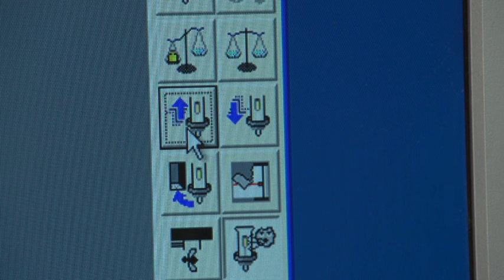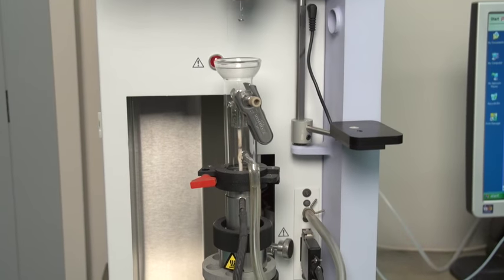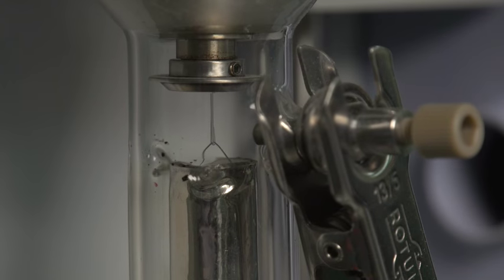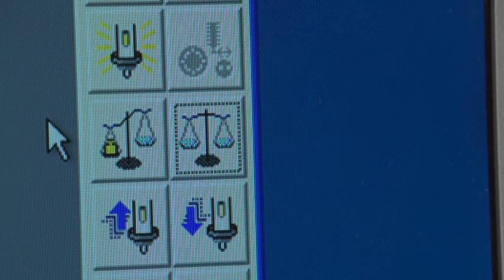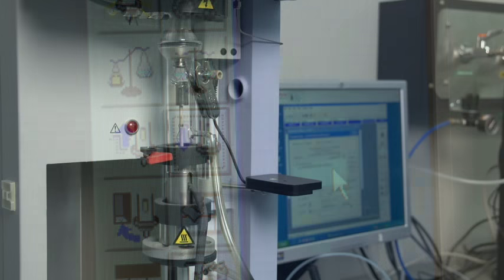Close the furnace by clicking on the Raise Furnace button. Make sure the stirrup is hanging freely and not clinging to the side of the furnace. Tare the pan by pressing the Zero Weight button. Open the furnace by clicking on the Lower Furnace button.